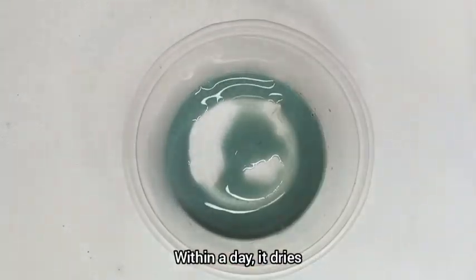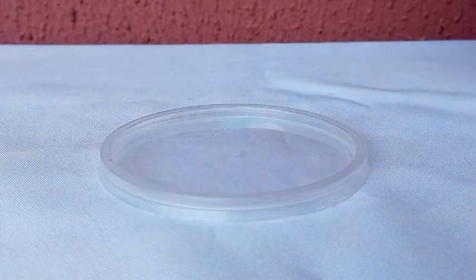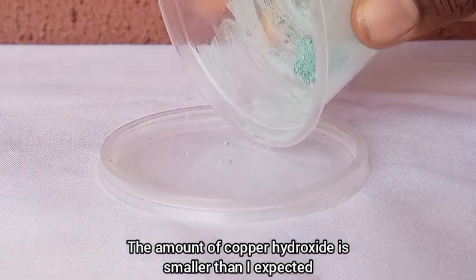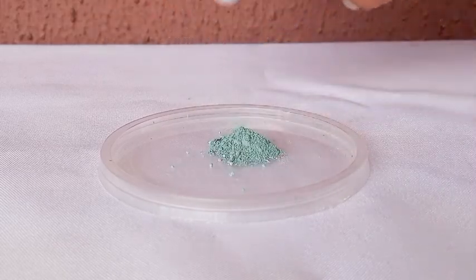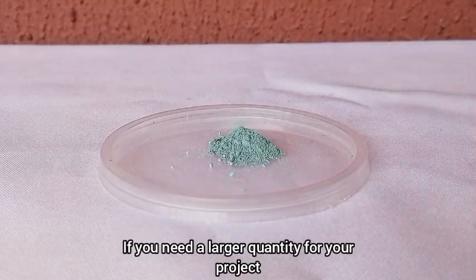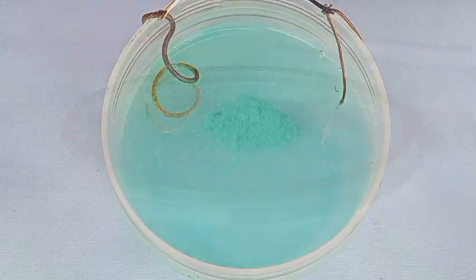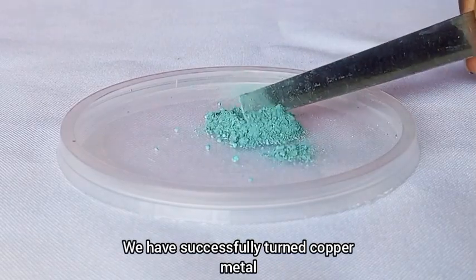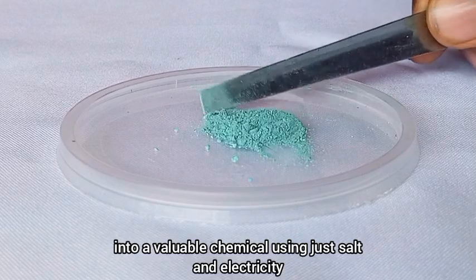Within a day, it dries, and we extract the precipitate. The amount of copper hydroxide is smaller than I expected, but this proves that the method works. If you need a larger quantity for your project, feel free to run the exact setup over and over. We have successfully turned copper metal into a valuable chemical using just salt and electricity.